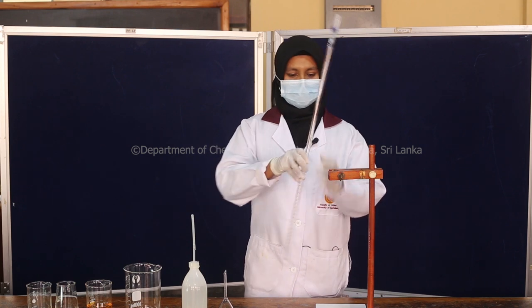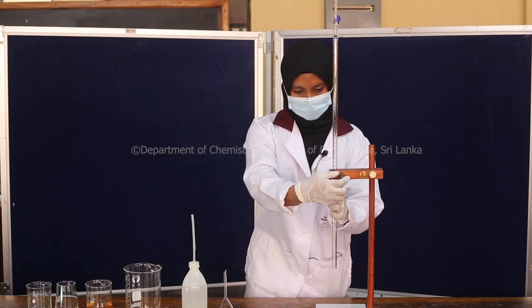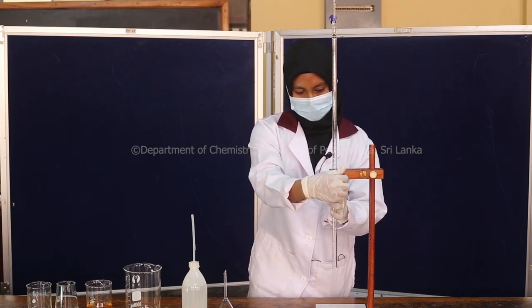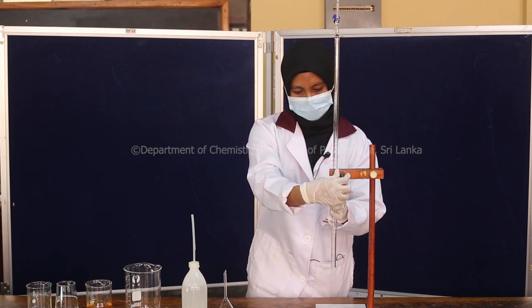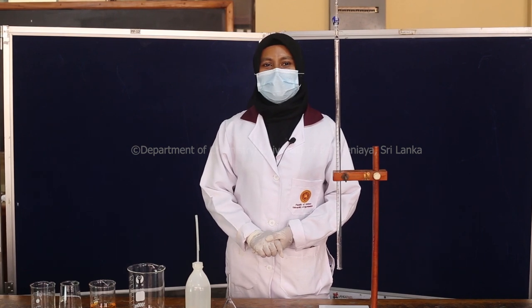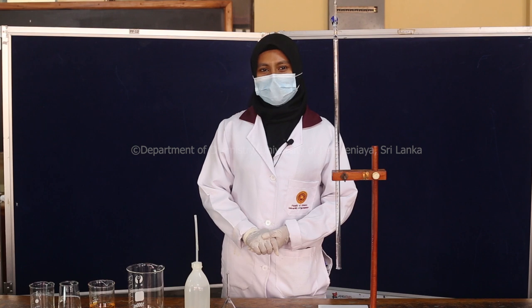After cleaning well, open up the tap and clamp the burette upside down to drain water. Once the water has drained, close the tap and clamp the burette upright again and place a clean glassware underneath.